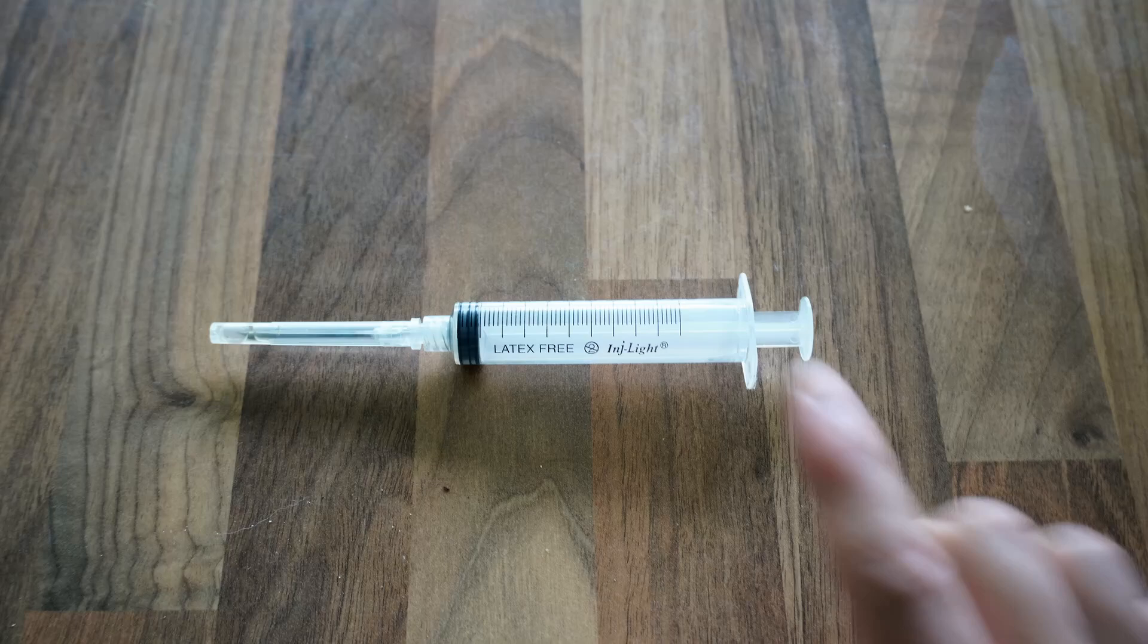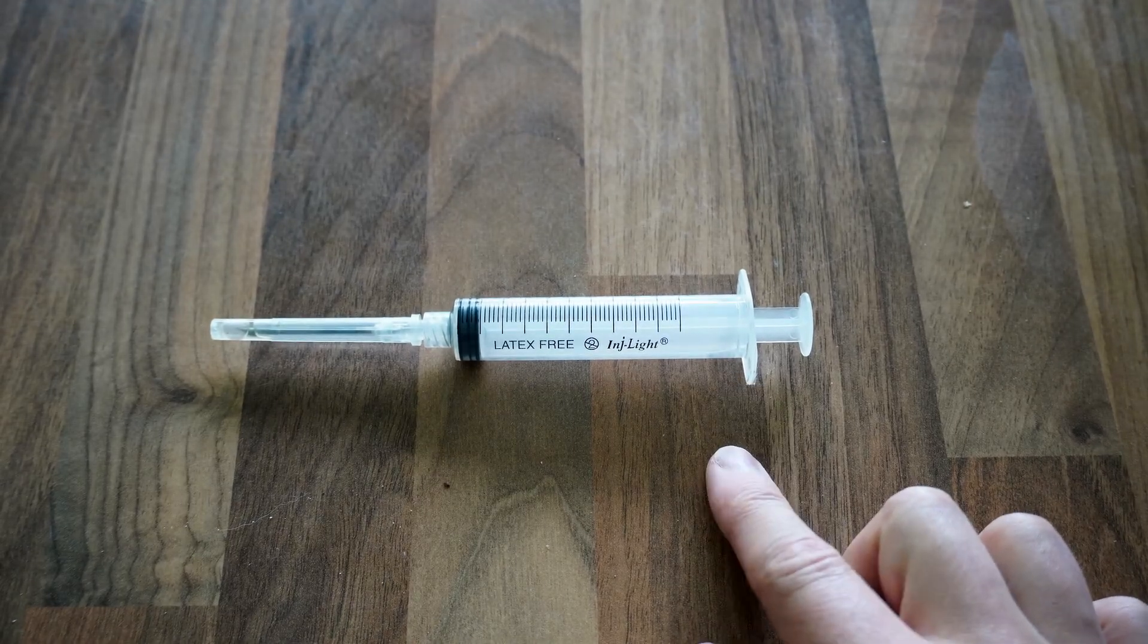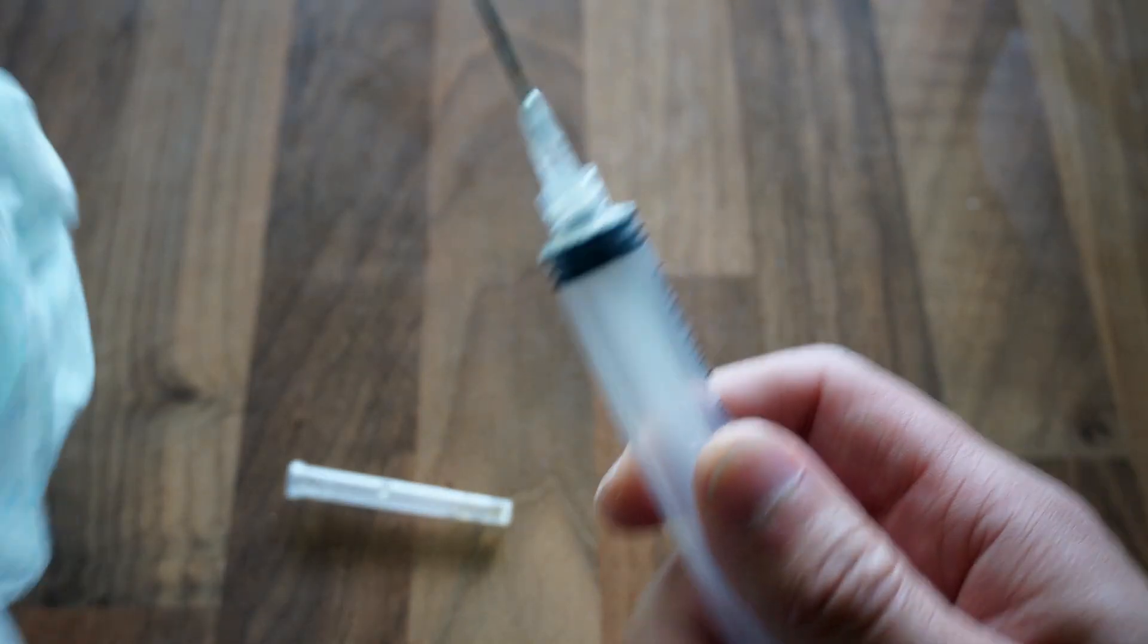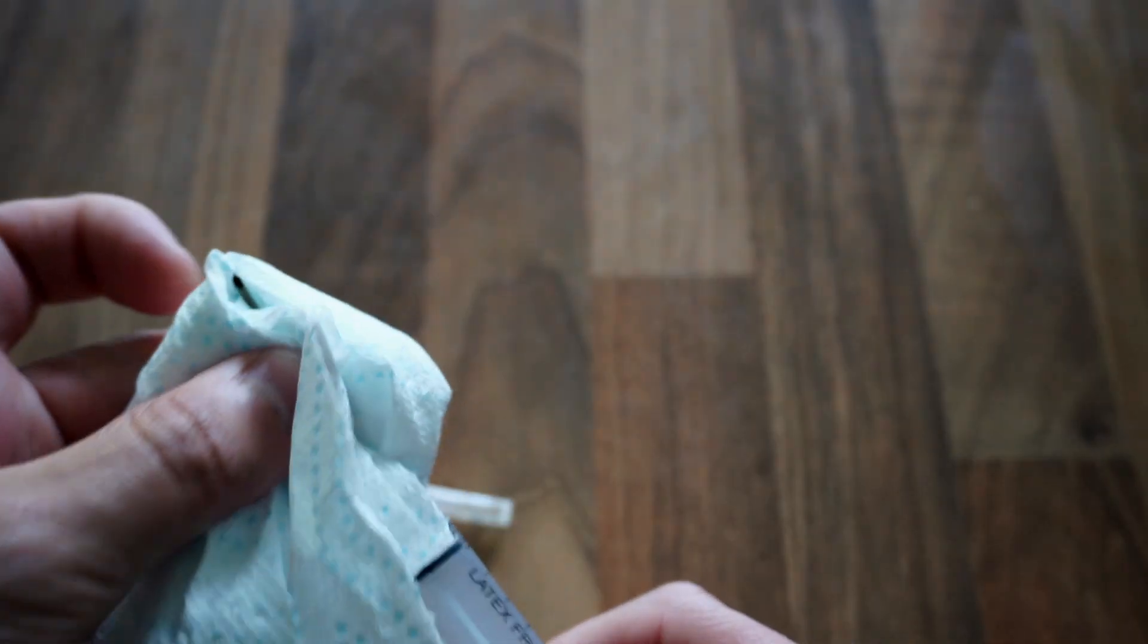I'm going to be starting off with a syringe which has already been used and I'll show you how to sterilize the syringe. First just give the needle tip a wipe down to get any debris off it.